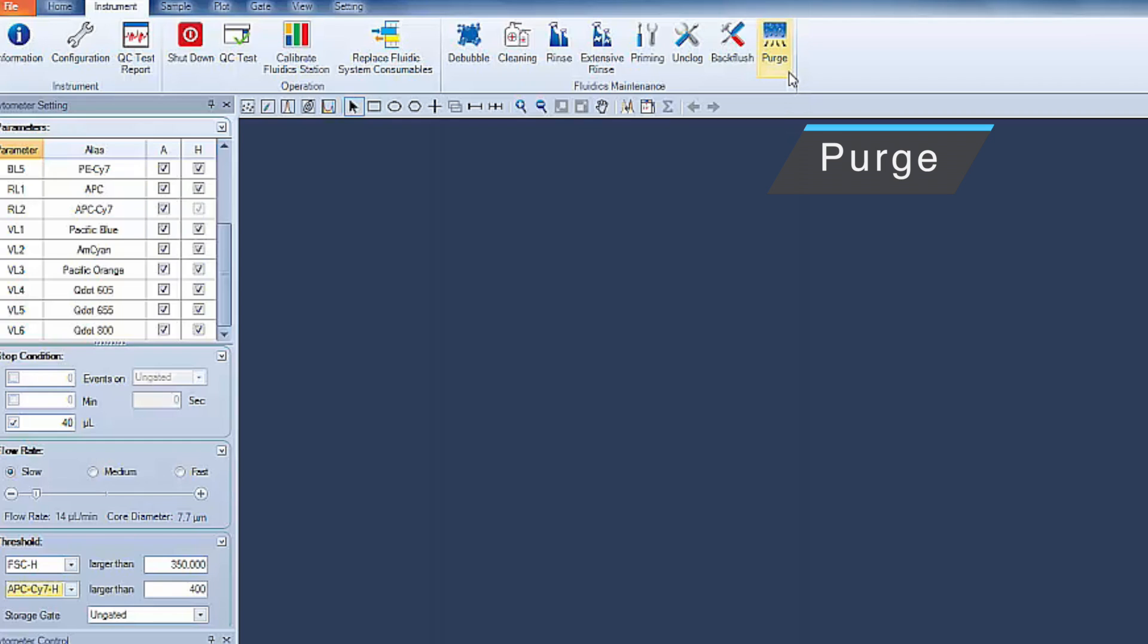Purge: if the NovoCyte needs to be shipped, click this button and follow the procedure shown on the pop-up window to purge the fluidic system before packaging and shipment.